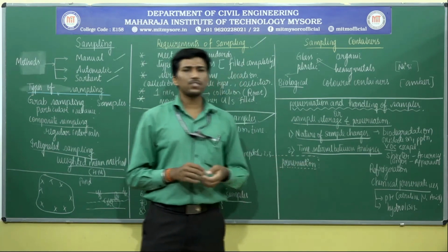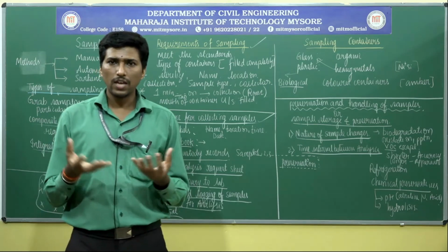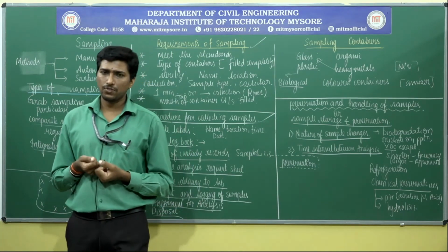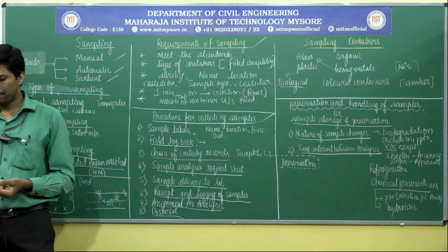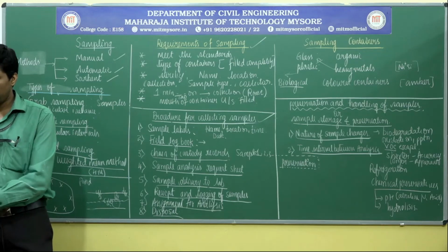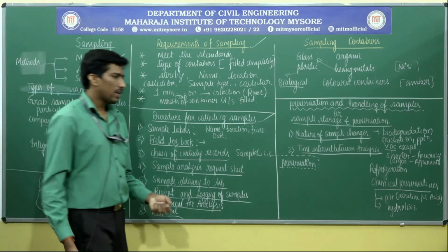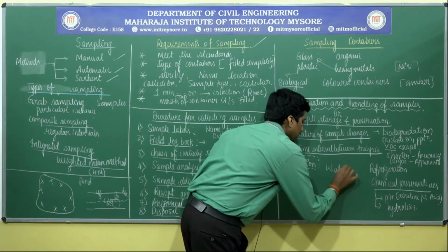Okay. The term preservation normally refers to retarding the changes that take place in the nature of the sample. And one more thing you have to keep in mind is that proper preservation is required. When you are taking the case of water, preservation is different.